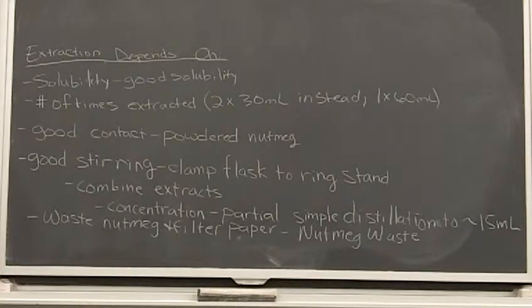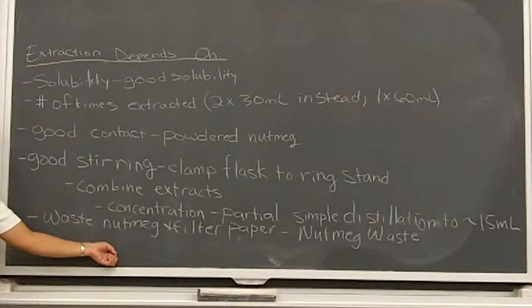Don't put any water, any solvent, anything like that in these waste containers. We're trying to dry out the nutmeg and the filter paper so we can throw things away, because once the ether is gone, it's no different than nutmeg you would be using to cook with. So it can go in the garbage. We just need to get the ether solvent off. So in this waste container, do not put any water or any solvent to transfer things into the waste container. Just put dry nutmeg and filter paper with nutmeg in there, okay?